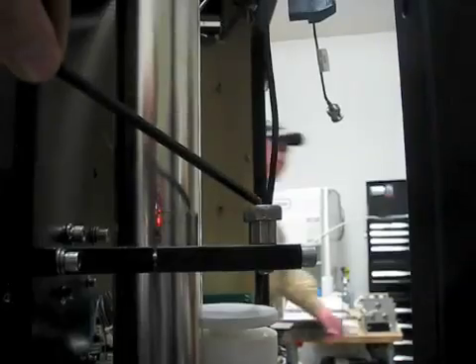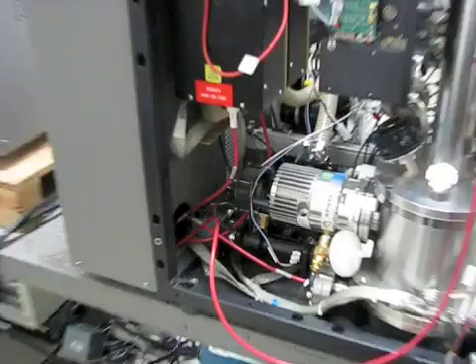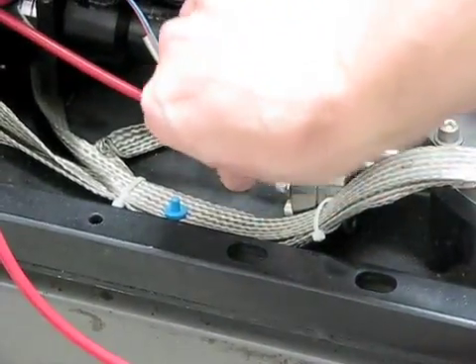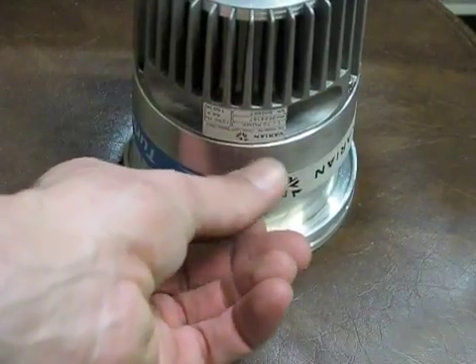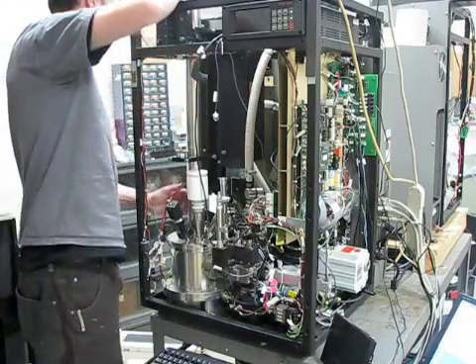Those two hex screws shown here are going to attach right there when you lift the flight tube to secure it. You'll also need to vent the system before you're able to open up. The newer style has this type of valve; the old style has a screw valve. Make sure not to damage or completely remove that valve.